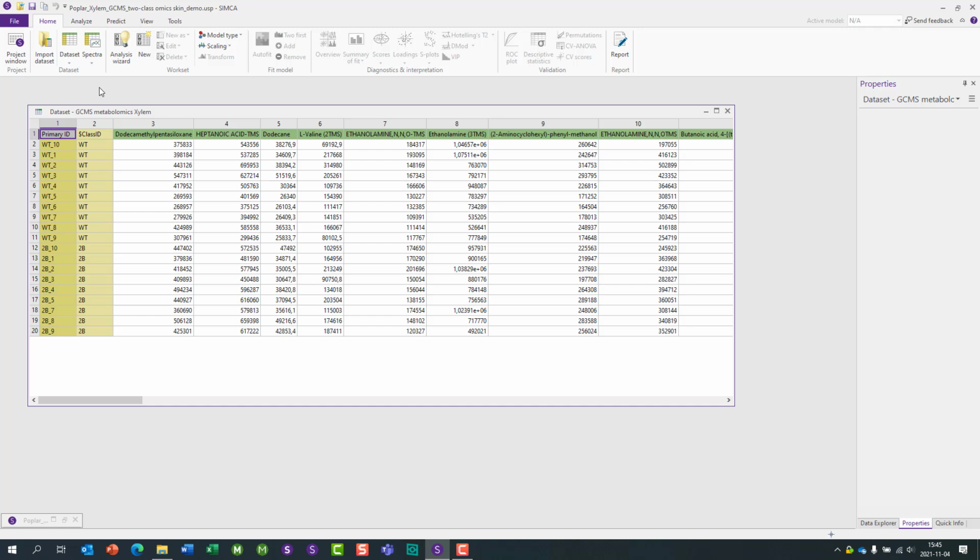Now you know how to set up an Omics project, and in another video we will walk through the analysis wizard, which is there to help you set up useful Omics models.